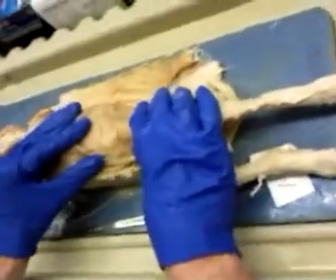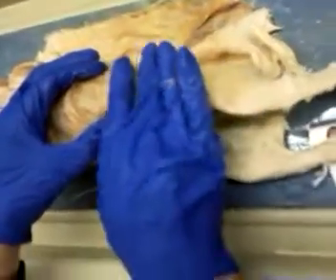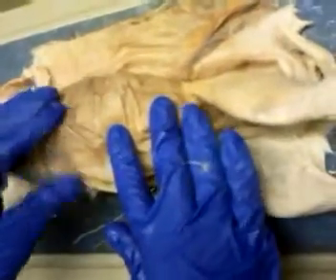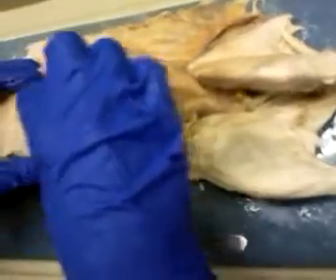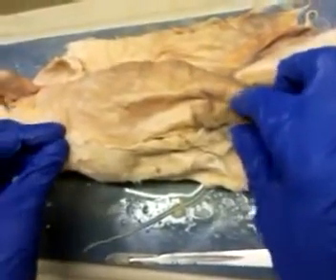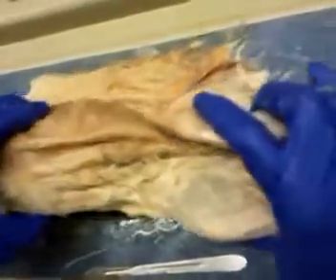Not an easy dissection. This is abdominal wall musculature, and there are actually 3 layers of muscle here: external oblique, internal oblique, and transversus abdominis. And then right down the midline there is a paired muscle called rectus abdominis that goes from the sternum to the pelvis. So you can imagine when the rabbit used its rectus abdominis, it was doing sit-ups. It's the same exact muscle, right?